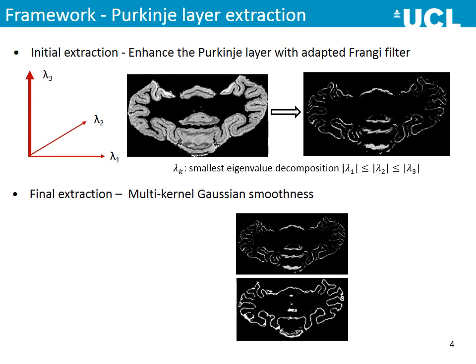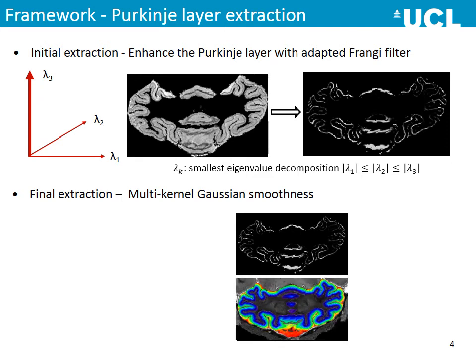The thicknesses are defined on the Purkinje layer and averaged for each segmented function-aware subregion. The distance to the inner cortical surface is defined as the granular layer thickness, and the distance to the outer surface is defined as the molecular layer thickness.